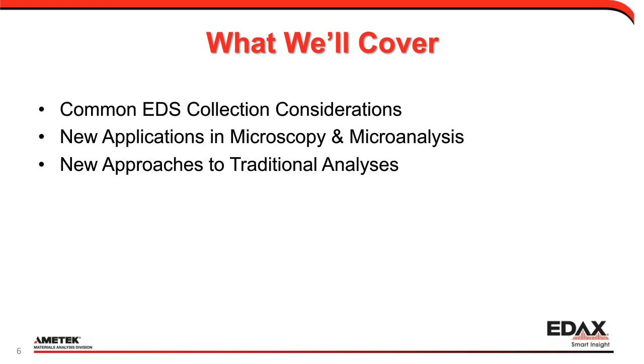This webinar was designed for maximum productivity, and we shortened the length of time so that you could come in, get some new tips and tricks, and then go about doing your work very quickly. I'll be introducing some new changes to common collection considerations, but also using data and examples to back up these new points.